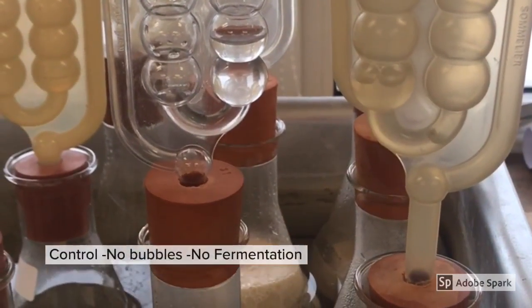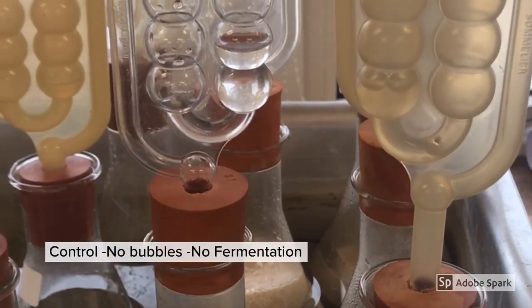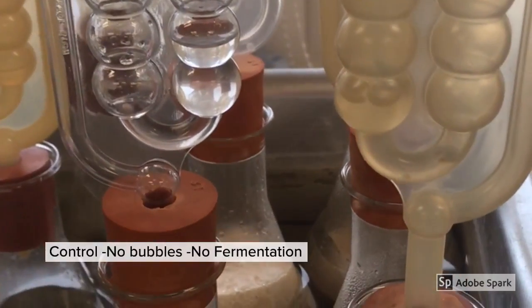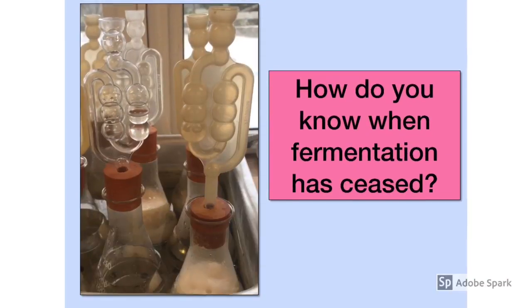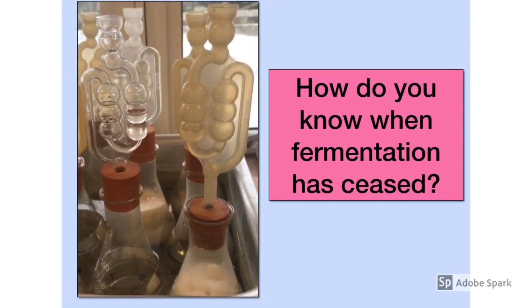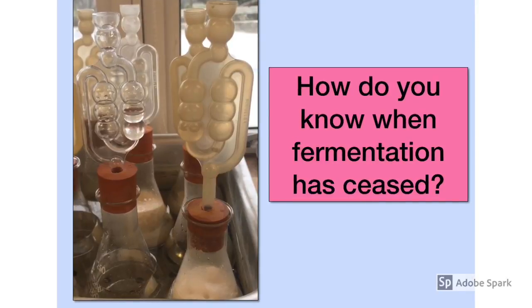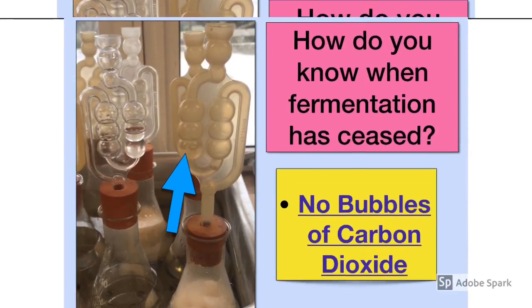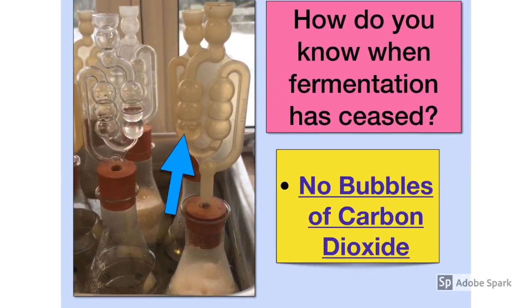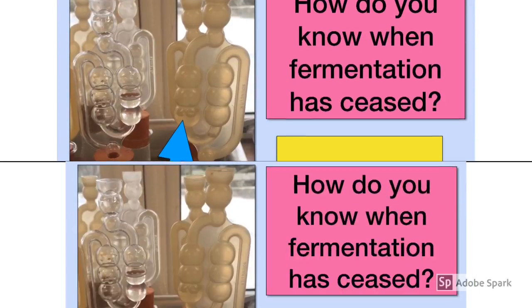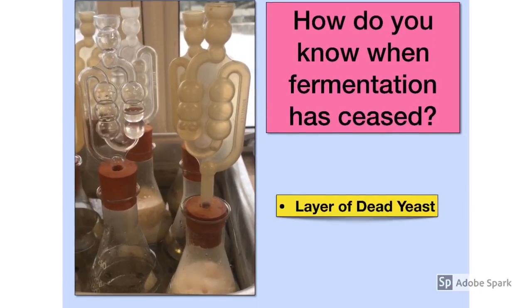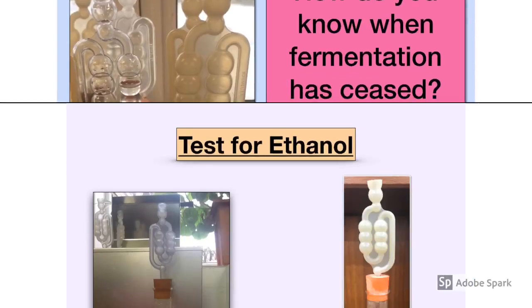Eventually these bubbles will turn the lime water milky, but only in the test flask, not in the control. When you examine both flasks the next day, how do you know that fermentation has ceased? The first thing you would notice is that there are no longer any bubbles of carbon dioxide being produced. You might also notice a layer of dead yeast.